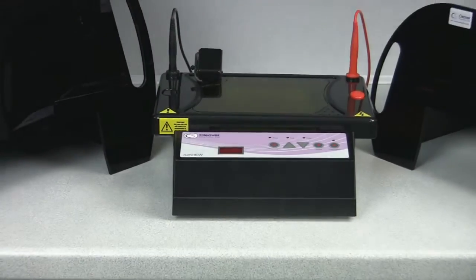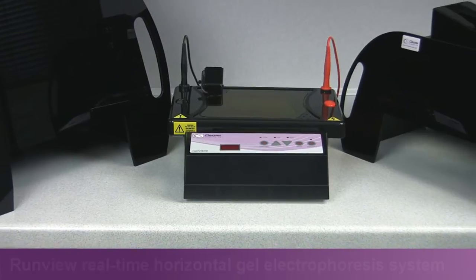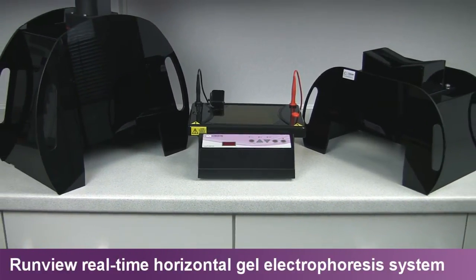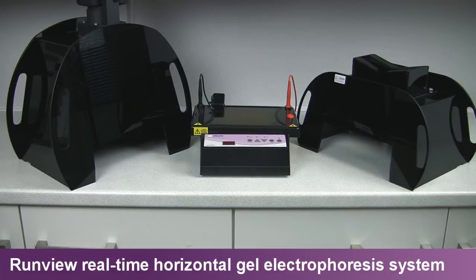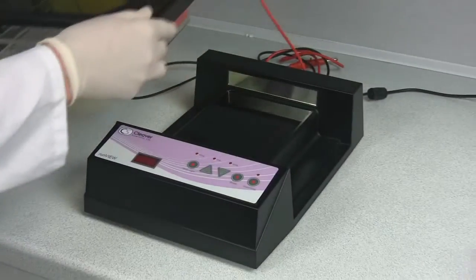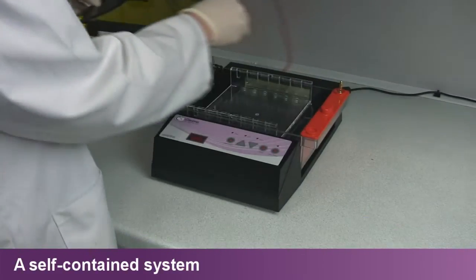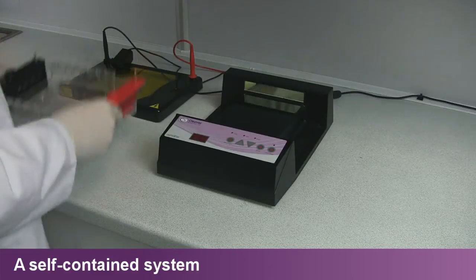RunView includes everything except reagents to run and see horizontal DNA gel electrophoresis in real time. It combines the versatility of Cleaver Scientific's MS Choice Trio system with the time and space saving convenience of a power supply and gel illuminator integrated within one benchtop unit.